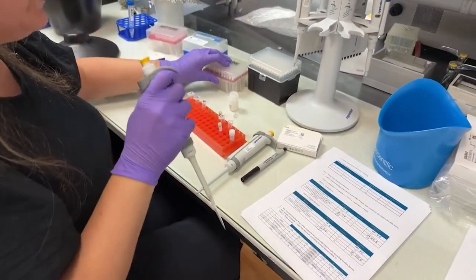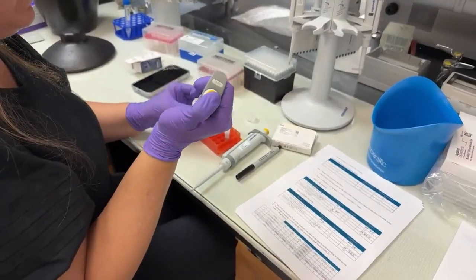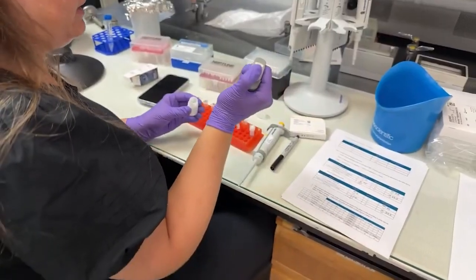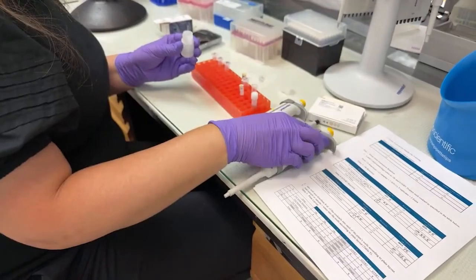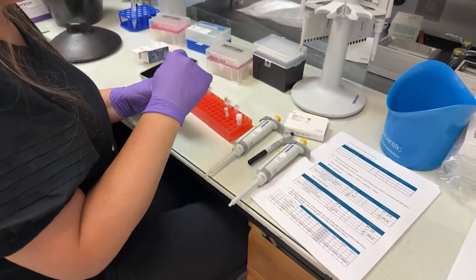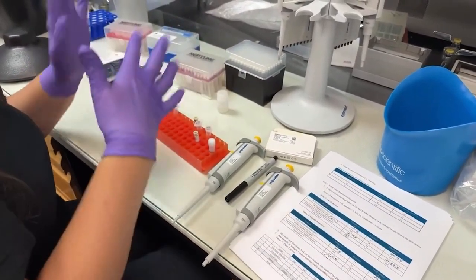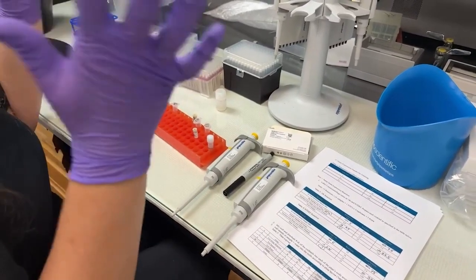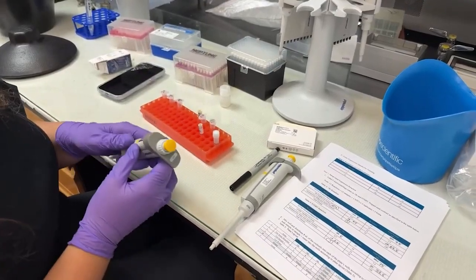So we had some key points we talked about for best practices. One of them was being efficient and clean. Some of the things you're going to notice while I'm working is that when I'm not using a tube, it stays closed. That is important because if I were to take my tips and wave them around, I can have those magical DNA particles, RNA particles, go who knows where, and we don't want that. So everything stays closed when you're not working with it.